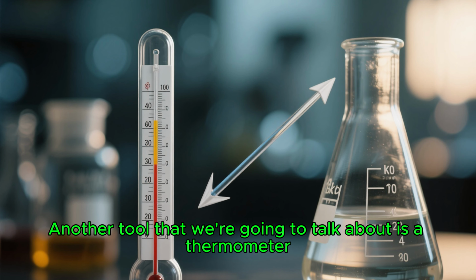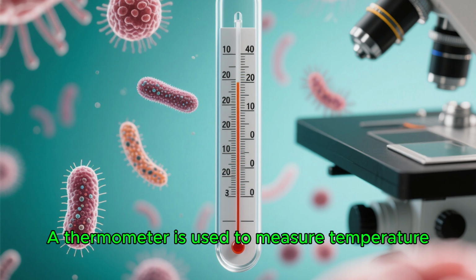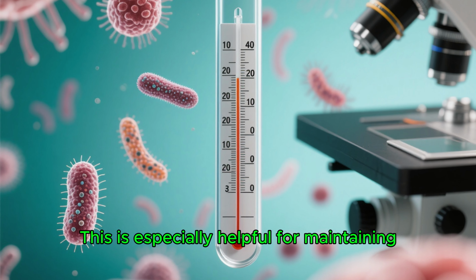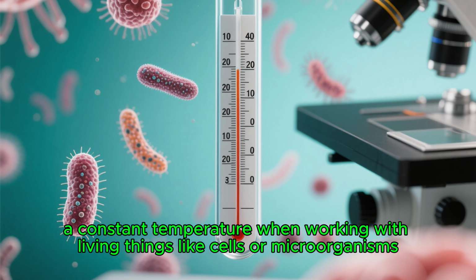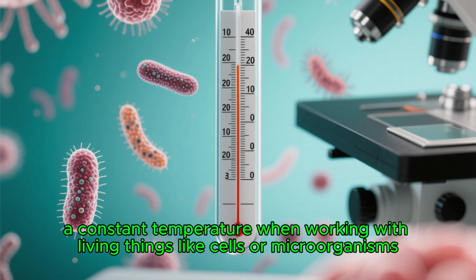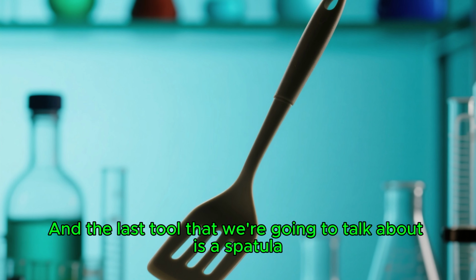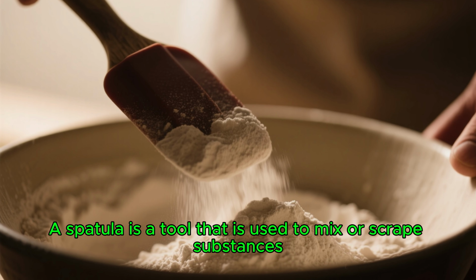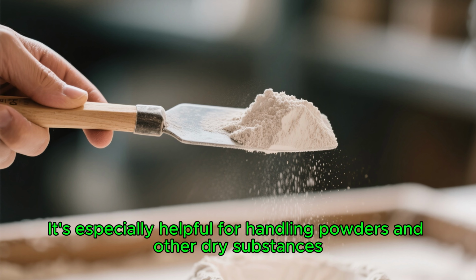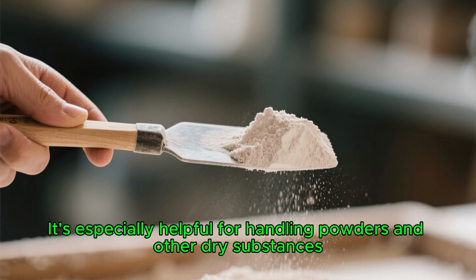Another tool that we're going to talk about is a thermometer. A thermometer is used to measure temperature. This is especially helpful for maintaining a constant temperature when working with living things like cells or microorganisms. And the last tool that we're going to talk about is a spatula. A spatula is a tool that is used to mix or scrape substances. It's especially helpful for handling powders and other dry substances.